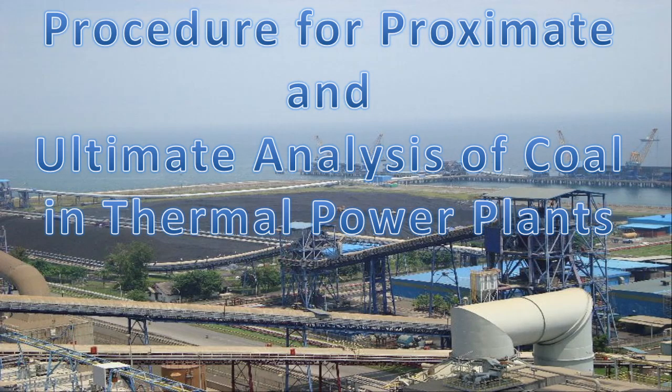Well, friends, today we will discuss the procedures for proximate and ultimate analysis of coal in thermal power plants. Generally, the ultimate analysis of coal is required for the calculation of some of the losses in the power plants, so that we can correlate them with the GCV.